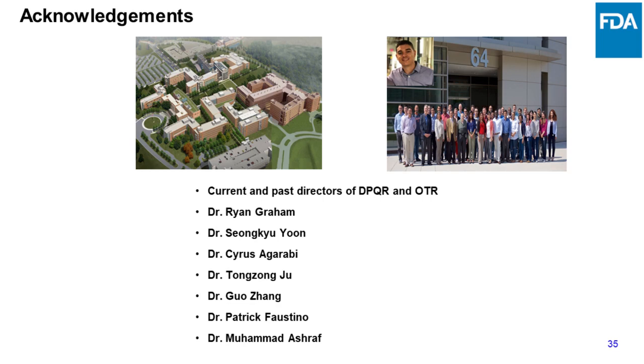I think you have to understand that when manufacturers develop these types of instrumentation, the critical component is the collision and reaction cell. And there's no question that having a quadrupole in the collision and reaction cell allows you to select a bandpass. The stability regions in a quadrupole are much better defined than a hexapole or an octapole, so you can actually control the bandpass. If there are any secondary reactions coming from the reaction gas and the matrix components or any impurities in the reaction gas, you have to be able to reject any interferences that could interfere with other analytes. So it's critical that you have control over that bandpass. You're sending the analyte ions through to the analyzer quadrupole, free of any further interferences produced by secondary reactions. And that's the difference.